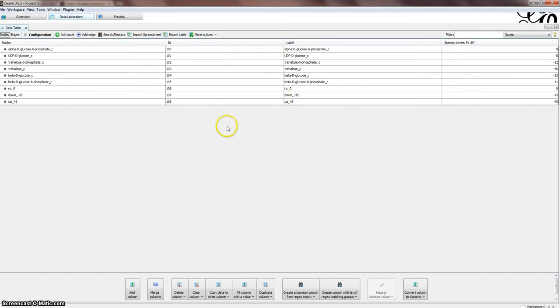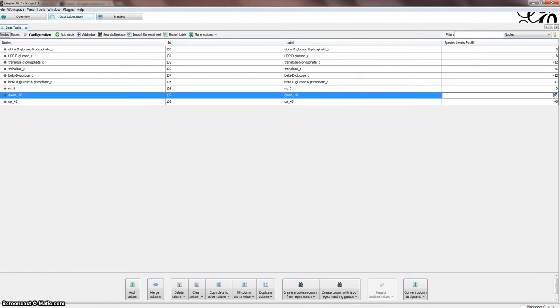It took the label that we had and it ID'd the nodes. We had our ID number, those came in all right, and our species differences. See how you have the negative numbers in here. You can't type in a negative number. You can't go in and try to edit a negative number either. If you click in here and do that, you hit enter, oh, it did it. Okay, I stand corrected. I don't know what changed between last time I was doing it and this time. Anyway, before it wasn't letting me do it, so maybe it will.